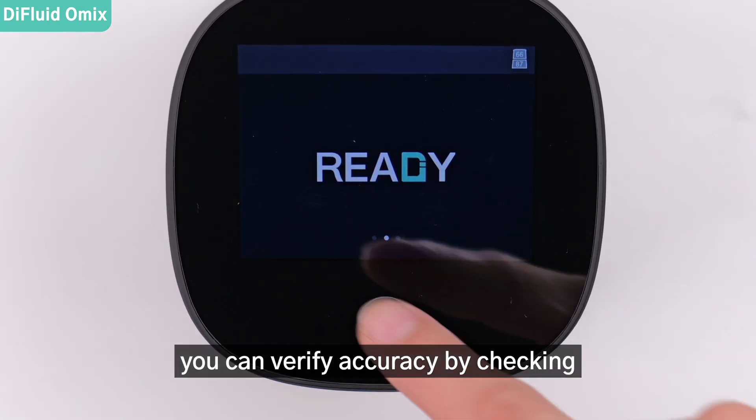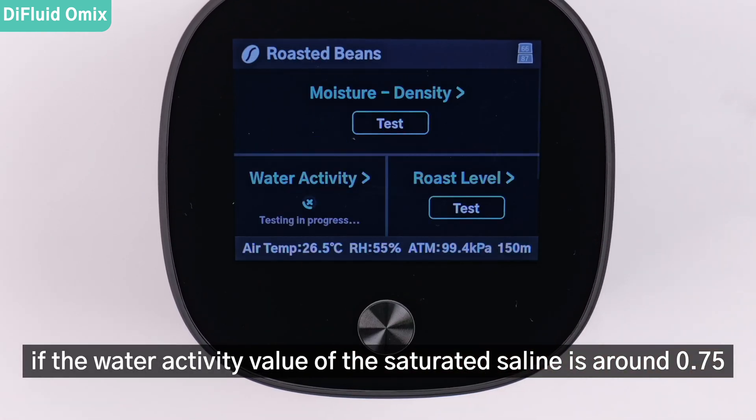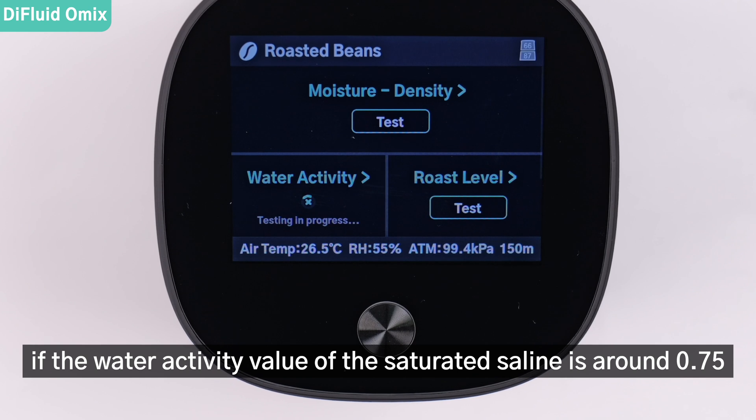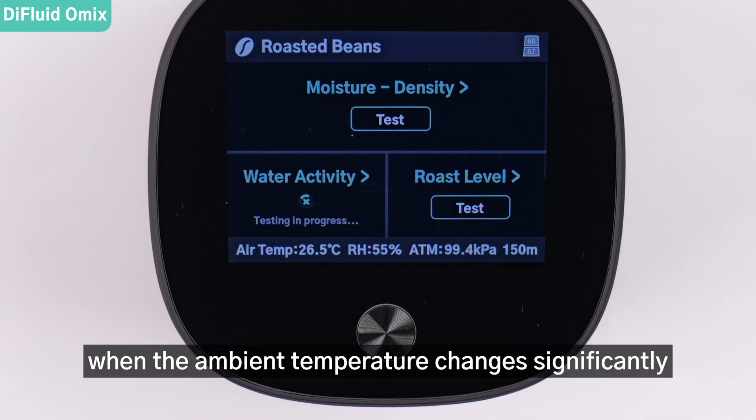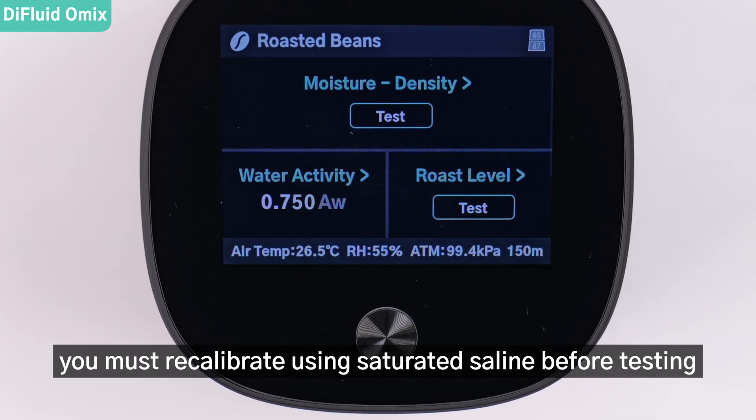After calibration, you can verify accuracy by checking if the water activity value of the saturated saline is around 0.75. It is important to note that when the ambient temperature changes significantly, you must recalibrate using saturated saline before testing.